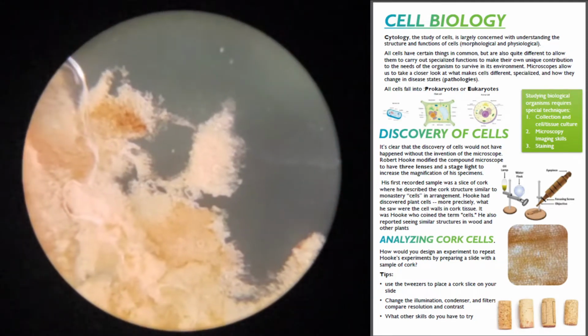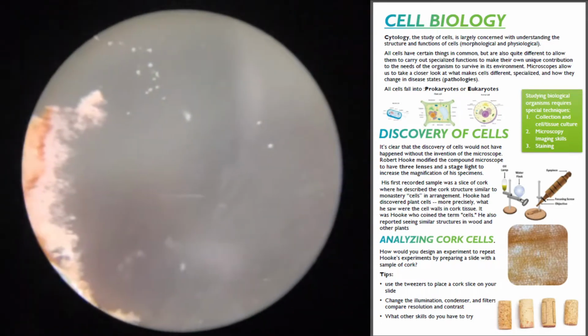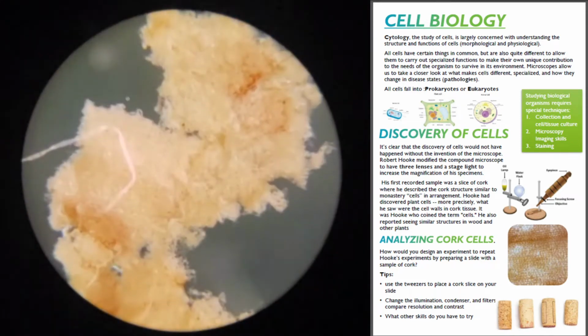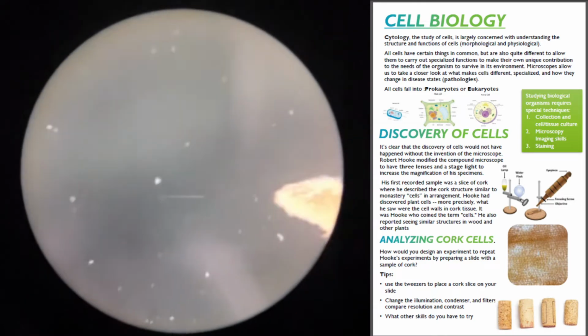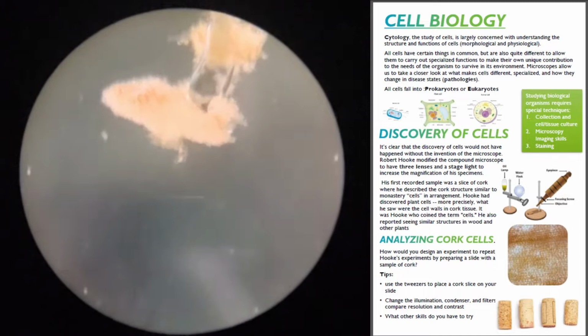What have I found? Is that my thinnest? We'll look around. Those are nice ones. Remember, I'm still on scanning, but look at that magnification. Crazy. Jump over here. I know I saw some more over on the edge. There it is. There a couple. Ooh.